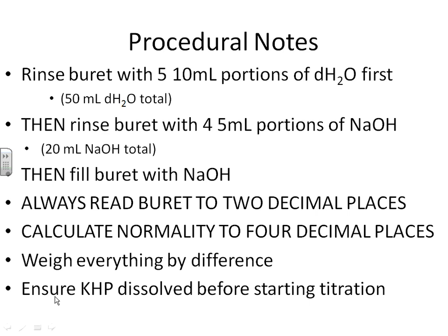Now, I will be supplying some samples to you because we need to use the Techi scales, the scales that go to 4 decimal places, and they can be kind of slow. So I will be massing some stuff out in advance for you, but the mass that I provide you with is not the mass of the KHP. It's the mass of the KHP on the weigh paper. So after you add your KHP to the water and dissolve the KHP, you're going to have to go back and get the mass of that weigh paper so that you can find the mass of the KHP by difference.